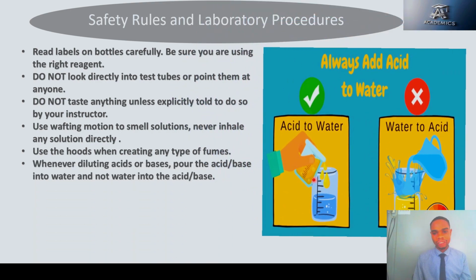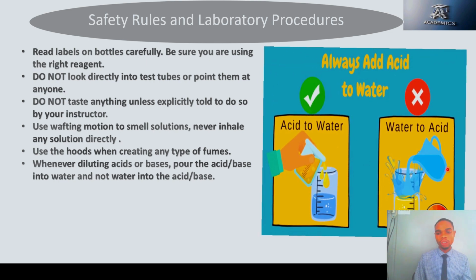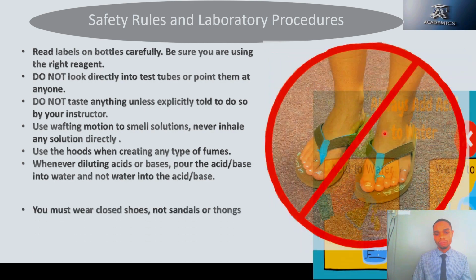And never add water to acid, but rather add acid to water. The reason is because this is a highly exothermic reaction, and the water can splash and spill on your face, which can lead to what? Burns. So always add acid to water, not water to acid.